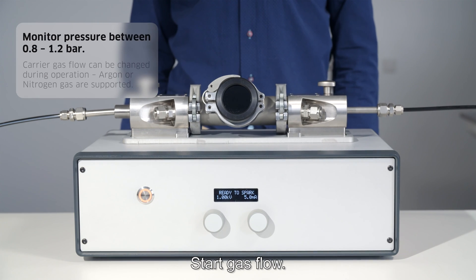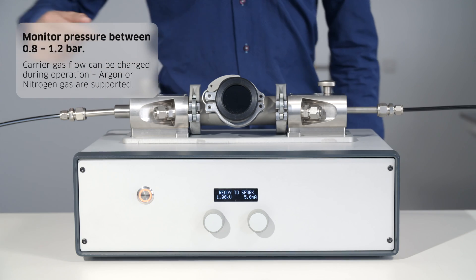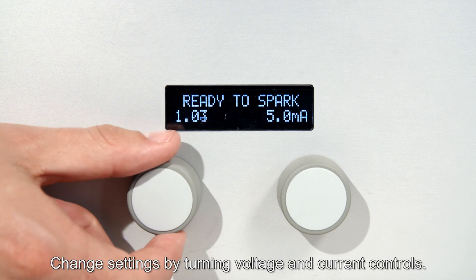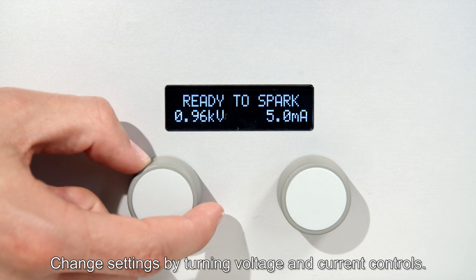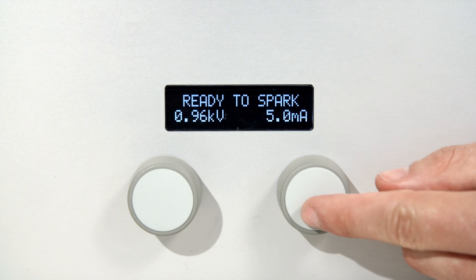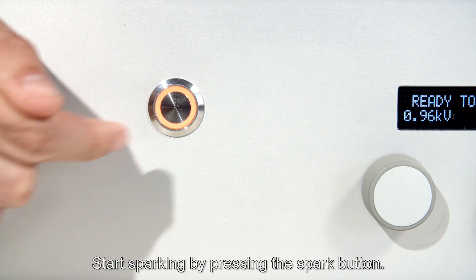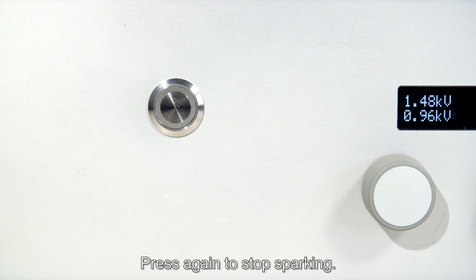Start gas flow. Change settings by turning the voltage and current controls. Start sparking by pressing the spark button. Press again to stop sparking.